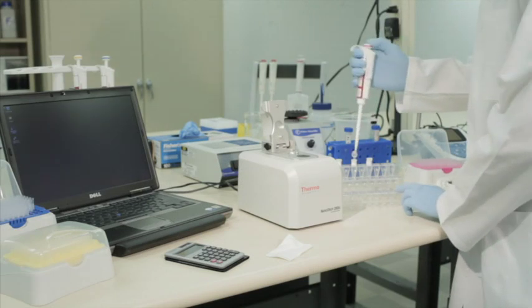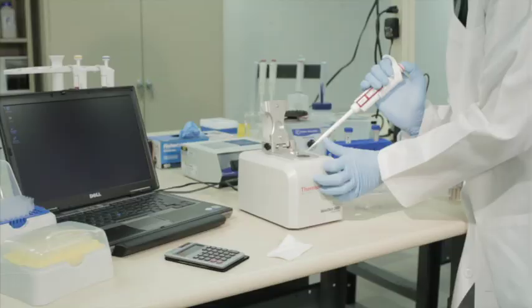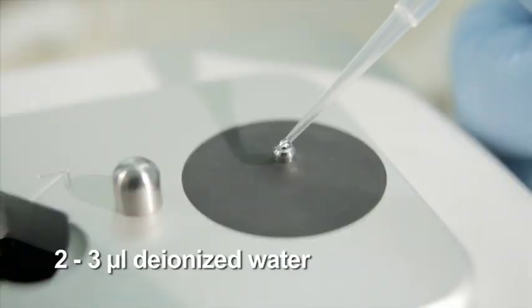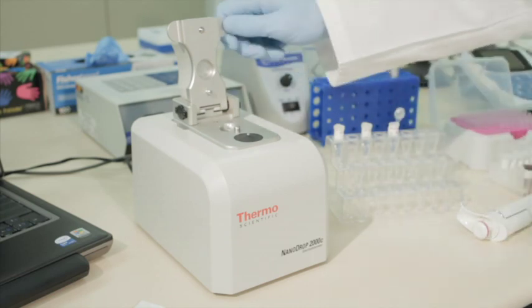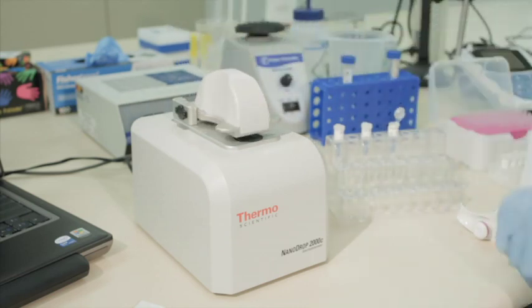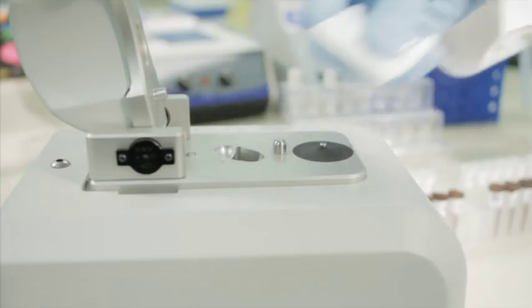To begin, clean the upper and lower optical surfaces of the microvolume spectrophotometer sample retention system by pipetting 2 to 3 microliters of clean deionized water onto the lower optical surface. Close the lever arm, ensuring that the upper pedestal comes in contact with the deionized water. Lift the lever arm and wipe off both optical surfaces with a clean, dry, lint-free lab wipe.